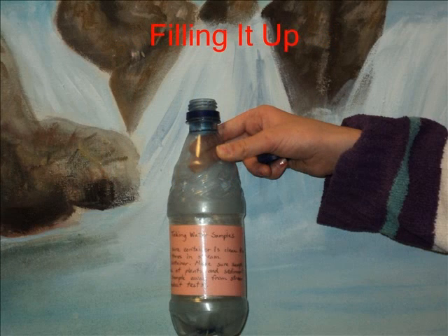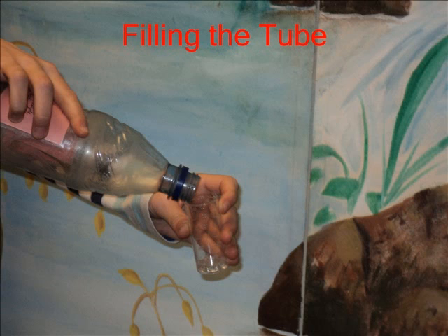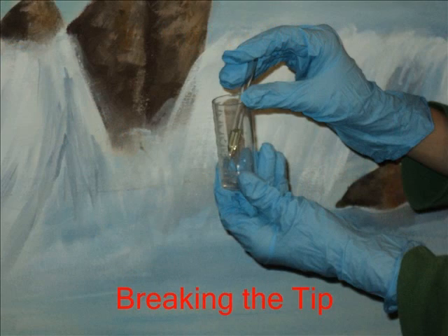Now that you have your tools, you are ready to test. First, gather a stream water sample, then rinse the test tube 3 times, but make sure to dump all of the water from rinsing into a waste container. Now, fill your test tube to 20 milliliters with a stream water sample. After that, take a vacuum tube and snap off the tip on the half circles on the bottom of the test tube. Leave the vacuum tube in until it is almost full. Then invert the vacuum tube 6 times.